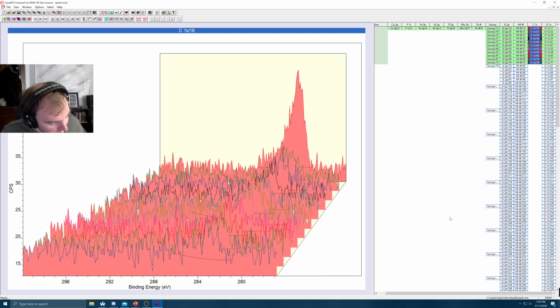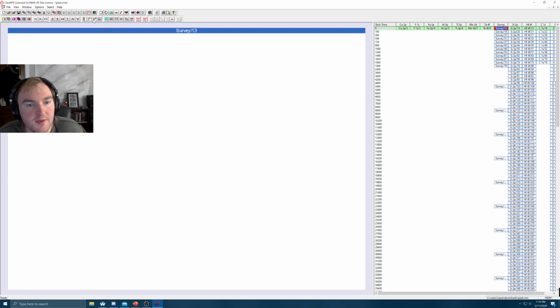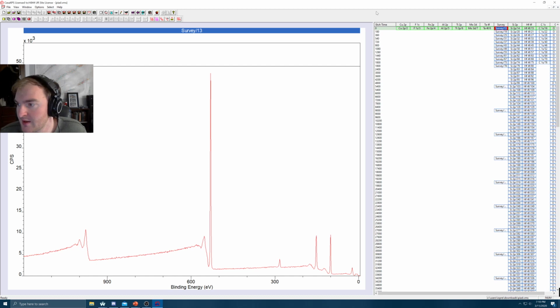Alright, so finally we'll move on to reporting. There are a couple ways that you can go about this. If you want to include a report in your survey, so let's say I have this survey here. Oh, we have to go back to 2D, so we'll click this a bunch of times and go back to our two-dimensional view. If we want an atomic percent table to appear on this image, it's fairly straightforward to do. Let's say we only want it for these first 1800 seconds of the etch time. If you do it for the entire thing, it'll make a table that's way too long, and that won't work. So you need to export that to Excel, which I'll show in a second.